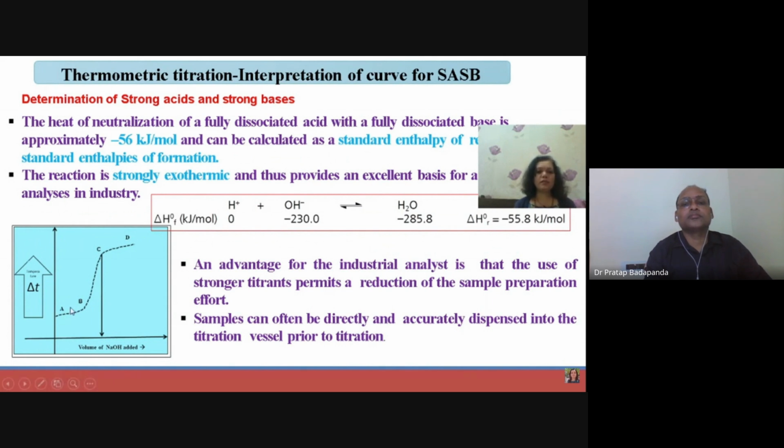The reaction is exothermic as an increase in temperature is observed during the process where acid is utilized to form a neutral product like salt and water, and excess addition of base shows this part CD, where I can find out the equivalence point by extrapolation of these 2 lines.